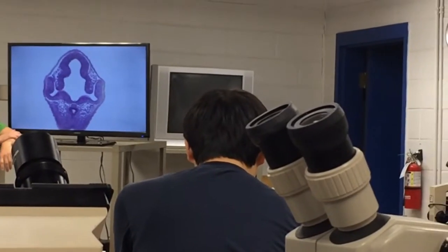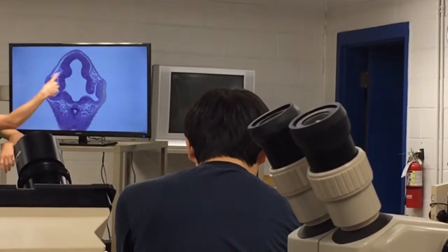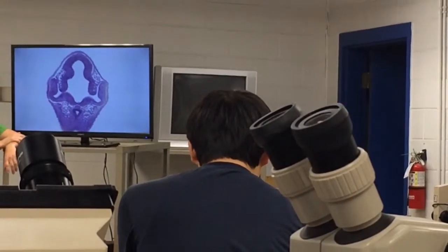The thick dorsal wall is obvious, so if that's the midbrain, what is the structure below it? Forebrain.